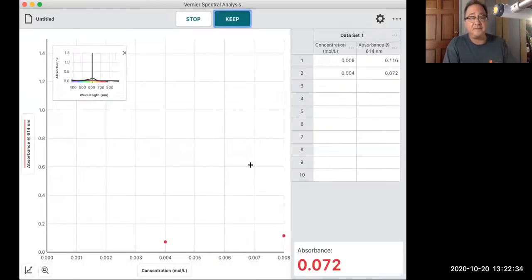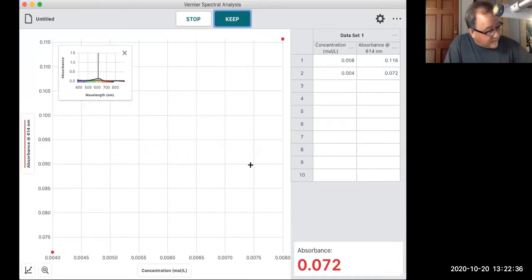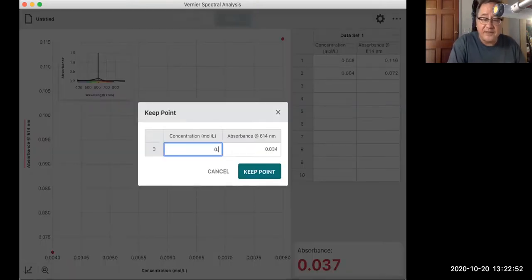Keep the point. And the last one here. And that one we'll keep, and that's 0.0020.